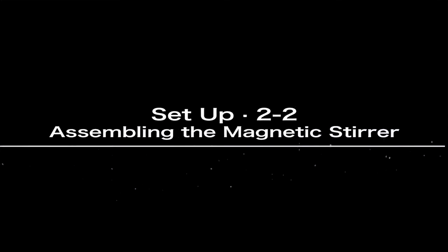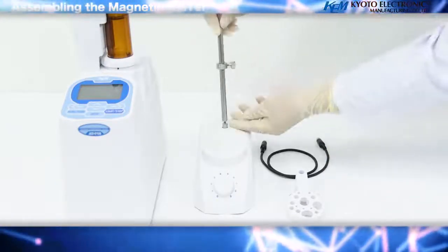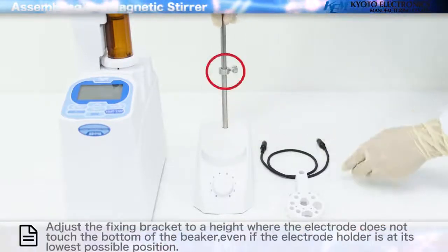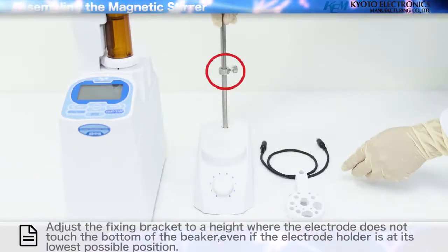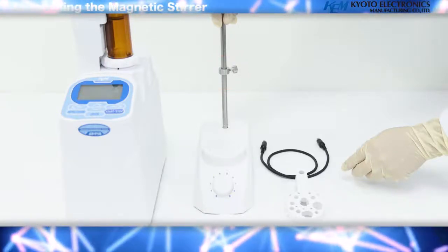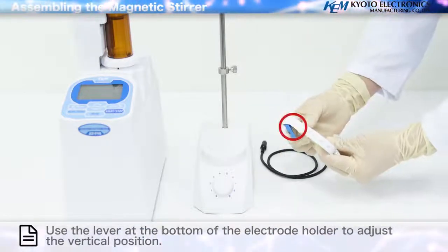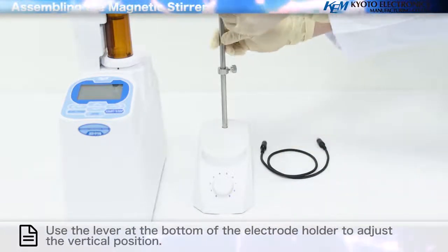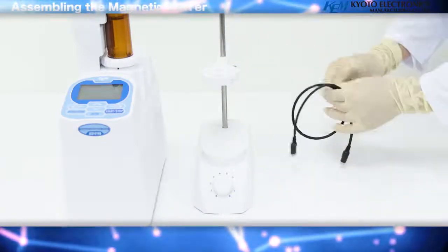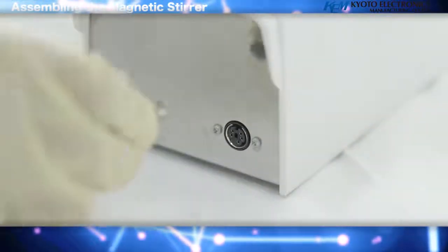Assembling the Magnetic Stirrer: screw the stand bar firmly into position as shown in the diagram of the magnetic stirrer. Adjust the fixing bracket to a height where the electrode does not touch the bottom of the beaker, even if the electrode holder is at its lowest possible position. Use the lever at the bottom of the electrode holder to adjust the vertical position. Insert the connector of the stirrer cable into the back of the magnetic stirrer.